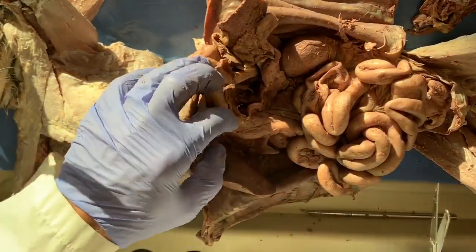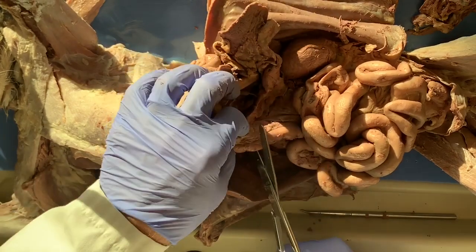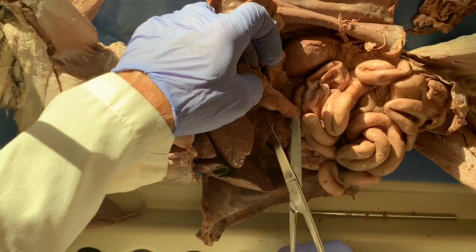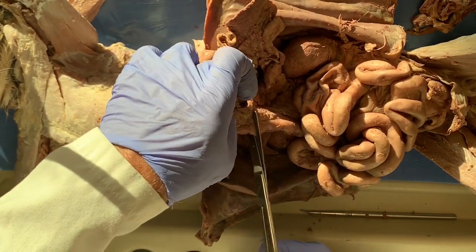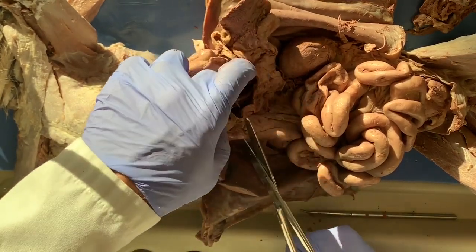Okay, so to remove the stomach, I have to disconnect it in two places. The first place is the duodenum, which is right here. You can see this is the pylorus of the stomach. This is the duodenum. So I'm going to give like a centimeter and cut it. Okay, we can get a good view of the pancreas right here.